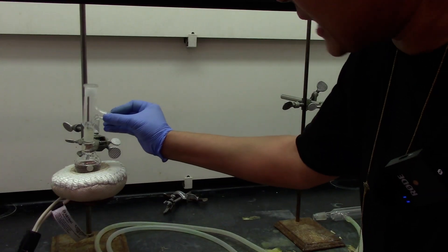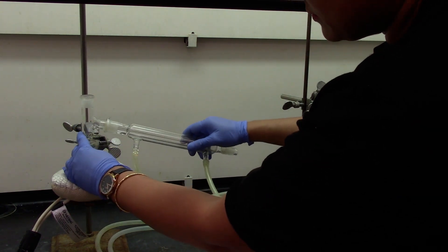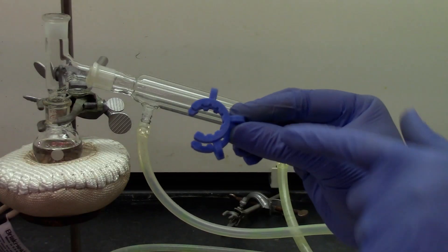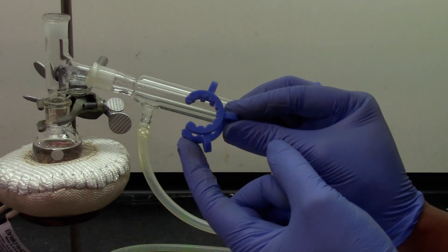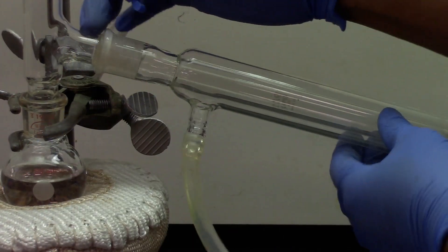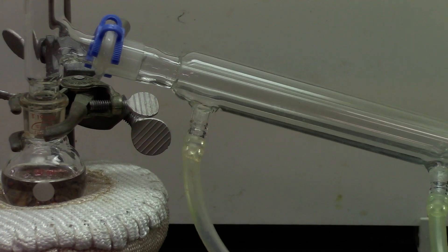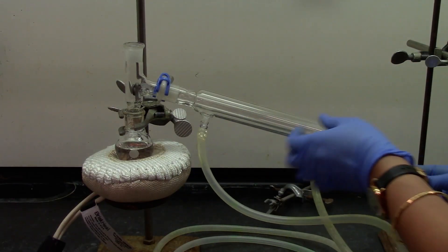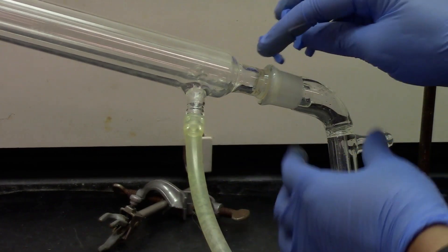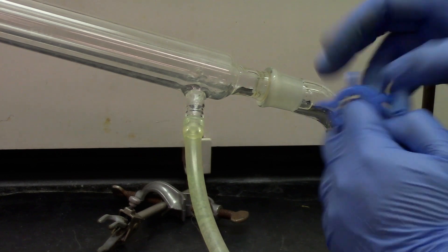We will start assembling the glassware. The distillation column goes on the three-way connector and this is a good spot to put your Keck clamp. The Keck clamp has a smaller neck on the top and wider neck on the bottom. So when you attach it here, it goes the same way — the smaller neck goes on the narrower end and the wider neck goes on the distillation column. You will be attaching your vacuum adapter at the end of the distillation column, and we can again put a Keck clamp. The narrow end goes onto the distillation column and the wider one goes onto the vacuum adapter.